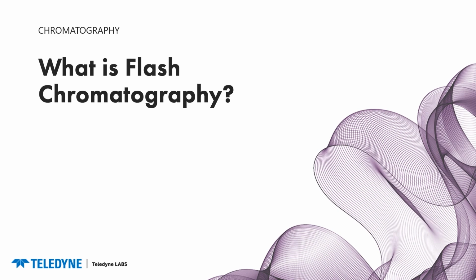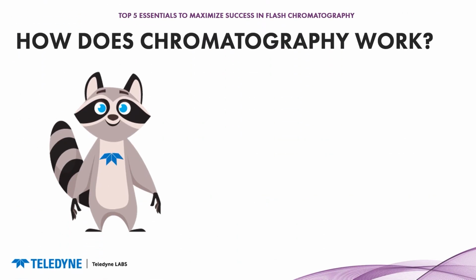So what is flash chromatography? Before we can answer the question of what flash chromatography is, first we need to understand how chromatography works. So with that, I'm going to get a little bit of help from our Teledyne ISCO chromatography mascot, Reddy the raccoon. So you're going to see a lot of Reddy throughout today's webinar. But what is chromatography? Well, in simple terms, chromatography is just the process used to separate different components of a mixture. A lot of time this is going to be a couple different compounds, but it could also just be A and B, and you want to get the best separation between those two as possible.